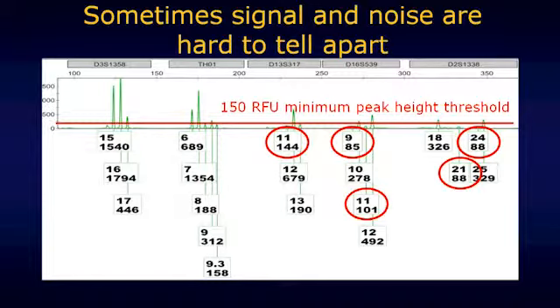For this particular electropherogram, you can see that's going to have implications for what? 5 different red circled peaks. And there's potential here for alternative interpretations of what's going on there. Somebody might want to look at those peaks and say, well, I do think that 11, for instance, at the D13 locus really is there. It's pretty close to the minimum peak height threshold.